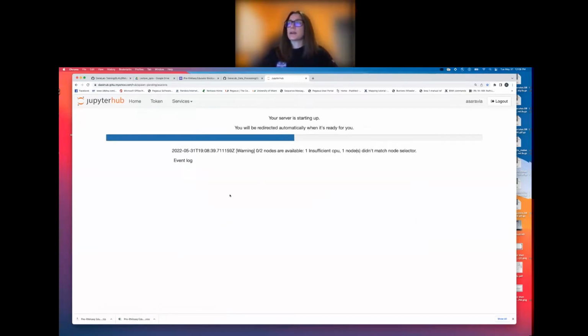And then this can sometimes take a minute or two to connect you to the compute resources. So it's scanning all the compute resources that are under the SMCE system and looking for ones that are available to reserve for your usage.